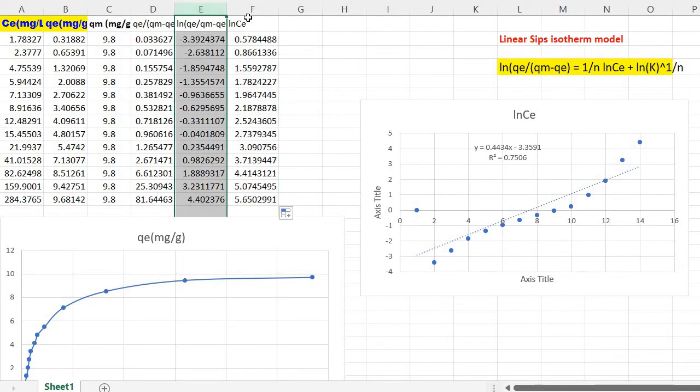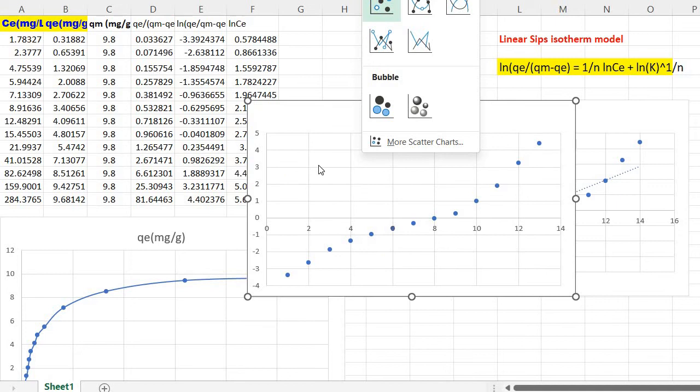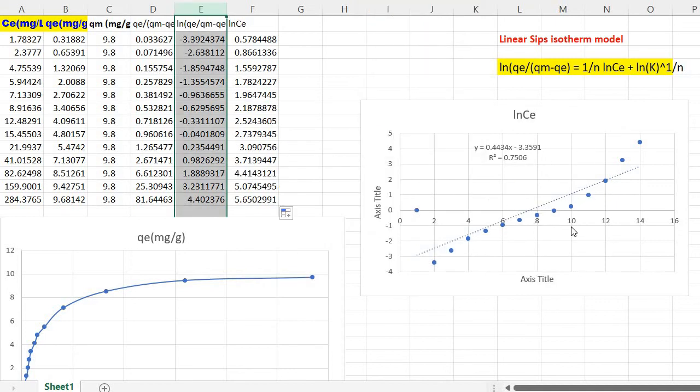Then select this two and go to insert, then select scatter. So this plot will appear. Our fit will depend on the data. So this is our data.